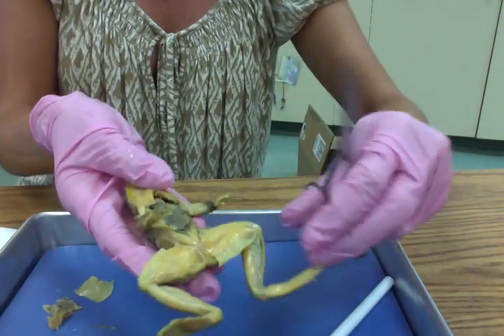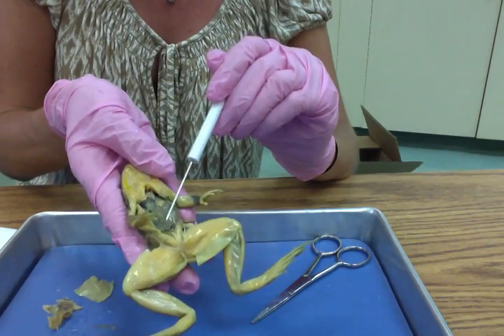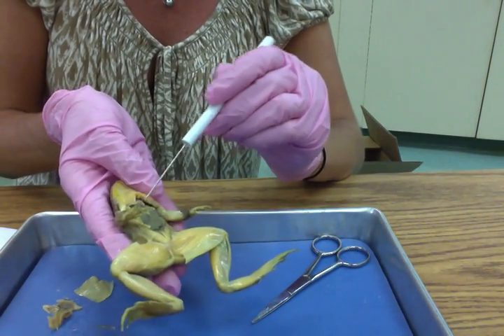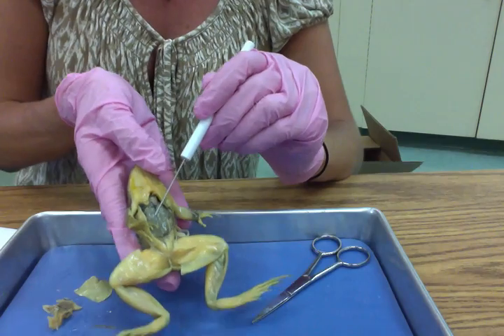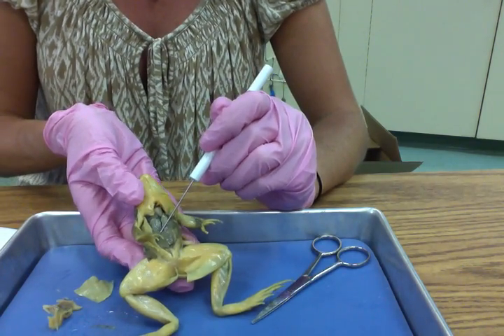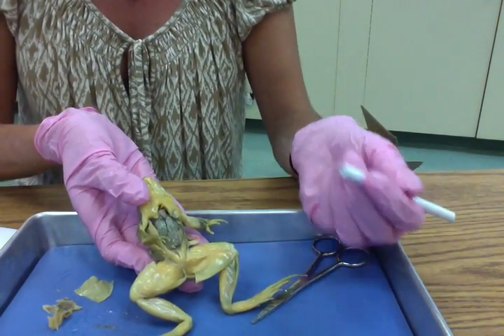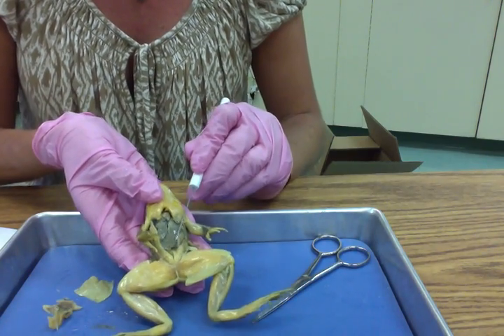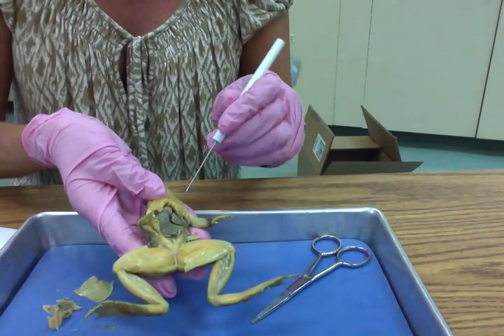Now the first thing that we see is this sort of tan gray blob, for lack of a better description. And we'll see that it has 3 sections. See, there's one over here, one here, and one here. That's going to be the liver. The liver helps the frog to metabolize, right? We learned metabolism is chemical reaction. So it helps digest or metabolize the toxins and fats that enter the frog's body. So the liver is a very important organ, as we can see from the size, right? It helps the frog digest toxins and fats.